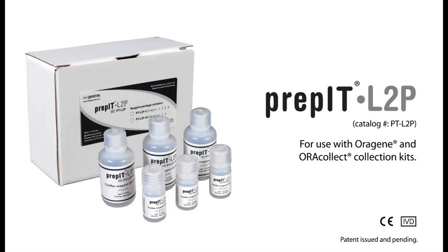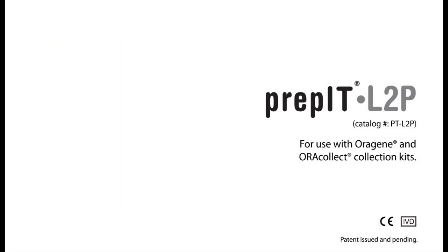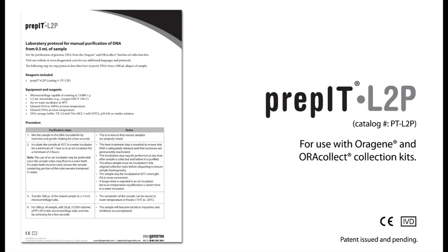This video demonstrates the steps involved in the purification of genomic DNA from the OraGene and OraCollect families of collection kits. These purification steps are fully described in the Laboratory Protocol for Manual Purification of DNA from 0.5 mL of Sample, document PD-PR-006, available at www.dnagenotech.com. Please note, watching this video is intended to supplement the written protocol and should not be used as a substitute for reading PD-PR-006.